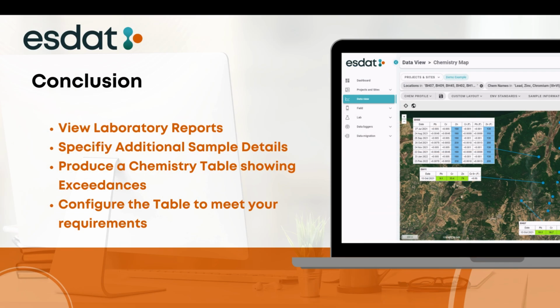After having reviewed this video, you should understand how to view laboratory reports, specify sample details and view your data on a chem table showing exceedances of specified environmental standards.